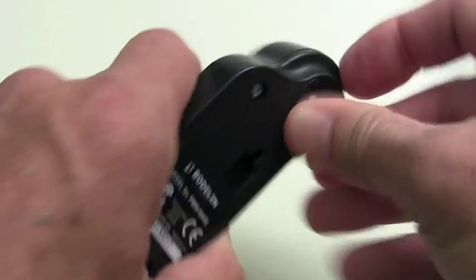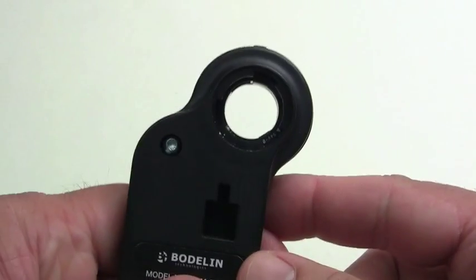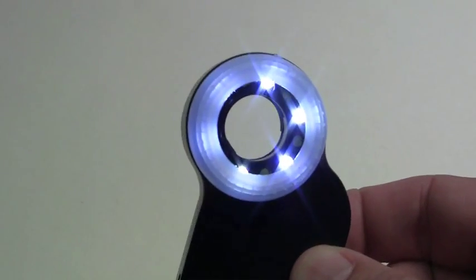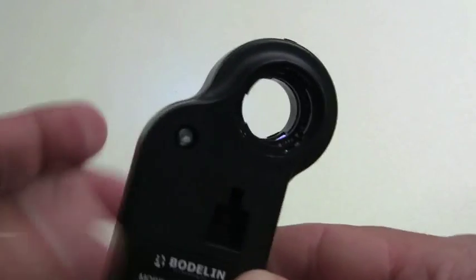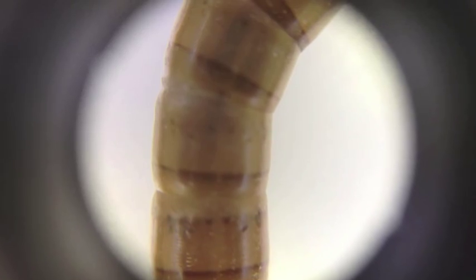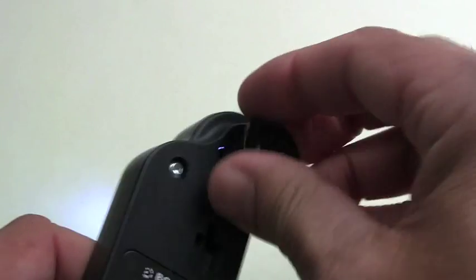You can also remove our ProScope MicroMobile lens and just use the iOS camera lens with our ring of LEDs for direct illumination without magnification. This is great for many medical applications, entomology, coins, gems, and stamps. Our lens acts as a magnified relay for your mobile device lens.